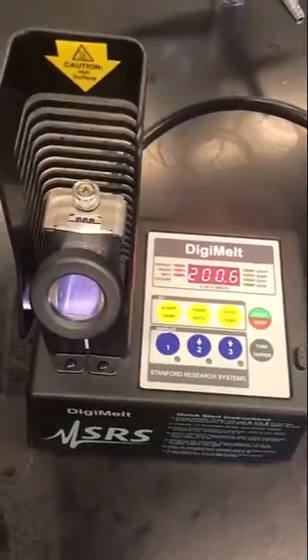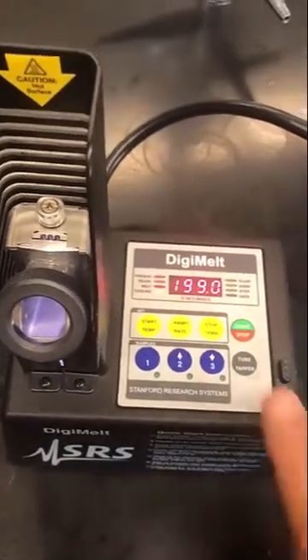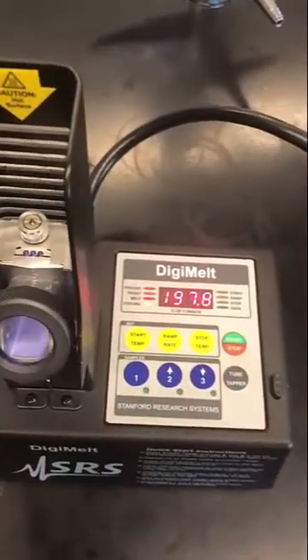I'm going to do a quick video on how to use our DigiMelts. I'd already just run a couple of things and played with it, so you can see the temperature is ramping down — I had it pretty hot.